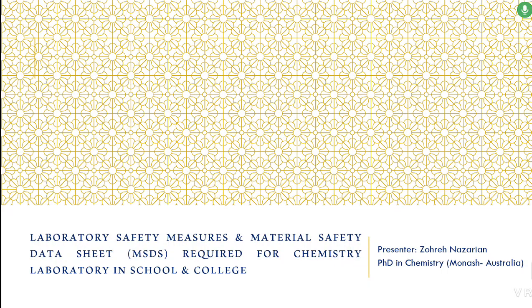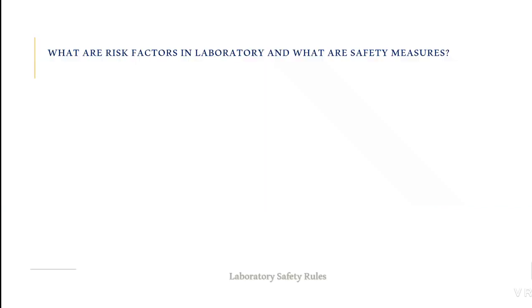Today, I'm going to give you a concise presentation on laboratory safety measures and material safety data sheet required for chemistry laboratory in a school and college. Having said that, laboratory safety measures are vast, and I'm going to give you a flavor of it. But first, what are risk factors in laboratory and what are safety measures?